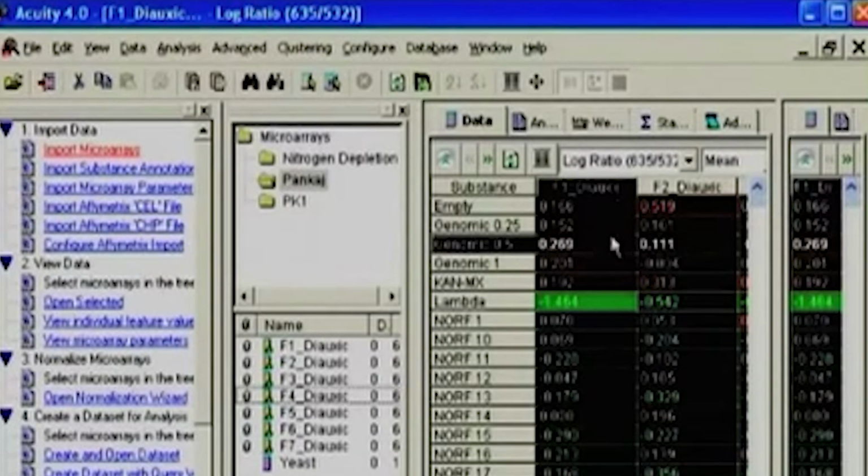One way to look is the numbers, which is a little cumbersome. The other way people like is color. If you carefully observe, the coloring scheme here is red, black and green. Maybe you can tell that it's a conventional theme for microarrays; people always represent these colors. So what does each of these color codes mean? Correct. The black color is towards 1.